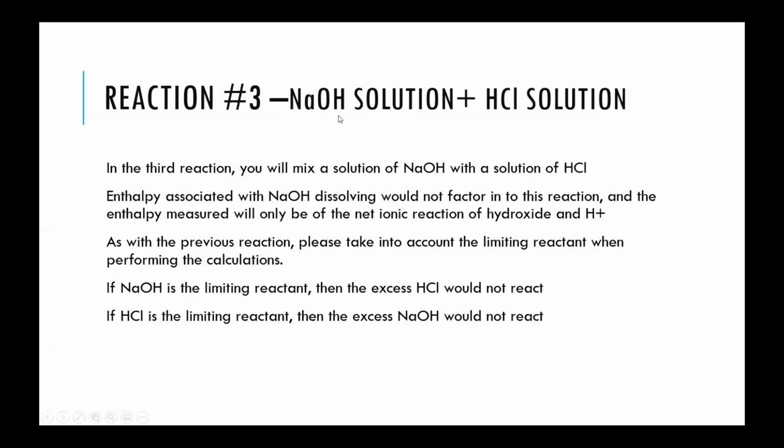That already happened when they made the sodium hydroxide solution. Now, in this step, the only reaction that's happening is with the hydroxide ion and the H+ ion. In all of these three reactions, be sure to take into account the limiting reactant.